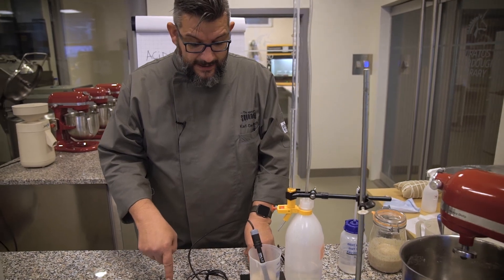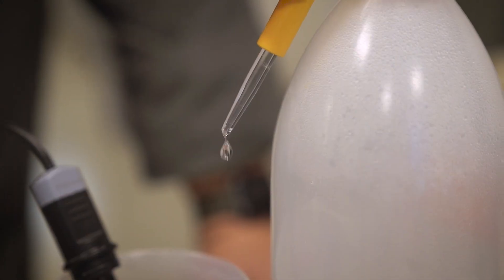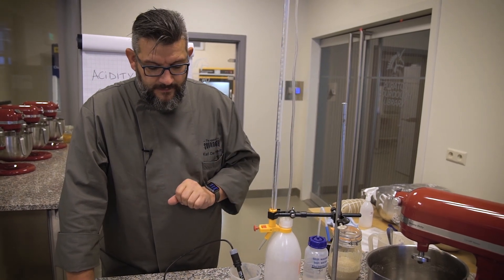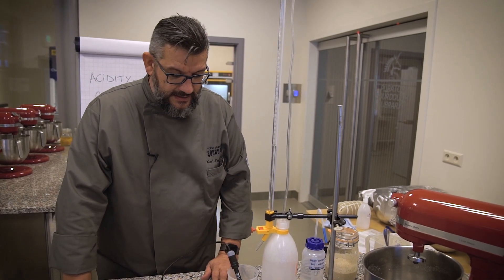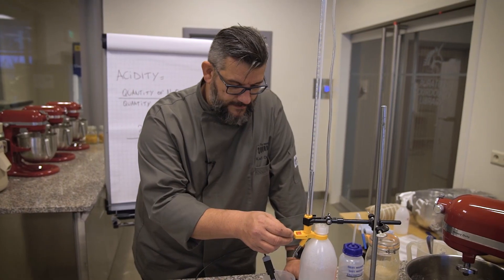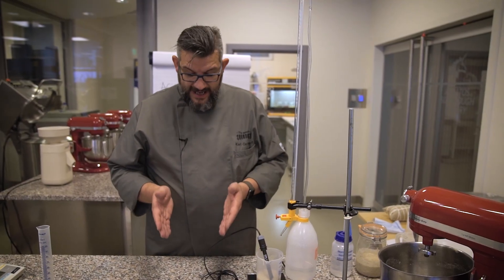Now I have to keep an eye on this — I don't want to go too fast. What we will do then is to measure how much sodium hydroxide I used, and that we will put into our calculation, and then we will know how much acid is present in the sourdough. We're almost there. Yes, we did it — 8.4!